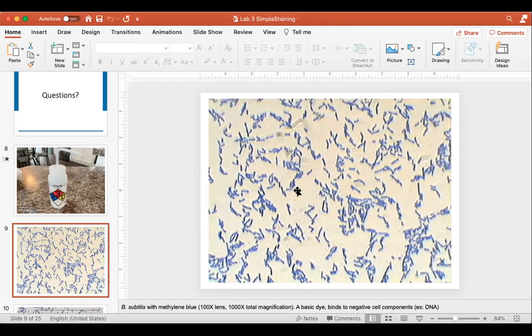These are what we call rod-shaped cells. The scientific name for this shape is Bacillus, which is also the name of the organism. It's called Bacillus subtilis. They kind of look like chromosomes before they come together, yeah, a little bit, right? They look like those stubby little condensed chromosomes that we sometimes see under the microscope.